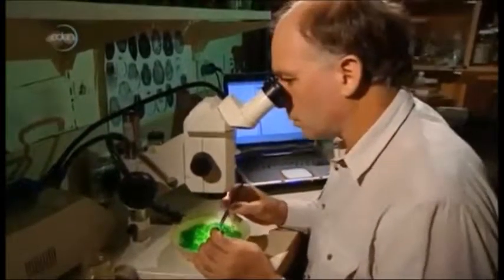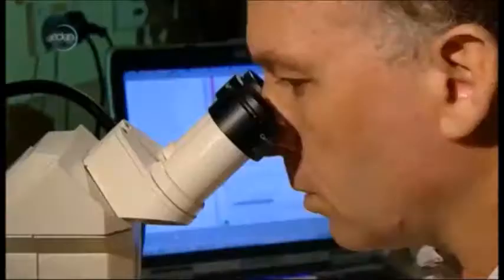From a leg you can just about learn anything you like about a lot of spiders, because there's a lot of information on the legs. That's different. It's got a third claw. The additional claw is remarkable. What's going on between the chelicerae?